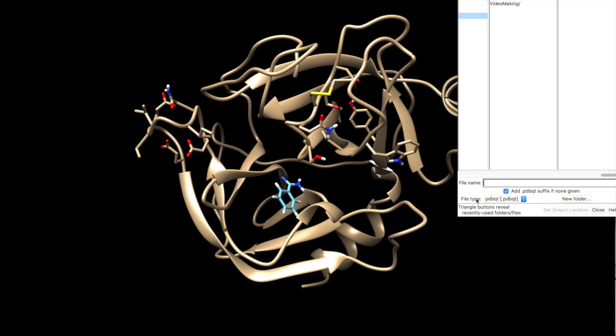And you can notice that the file type is different. So this is a file format called PDBQT. You can read in the documentation how the format is made. Basically, this is a PDB file format plus charges that are applied on the atoms. Okay, so docking, and let's do benzamidine trypsin.